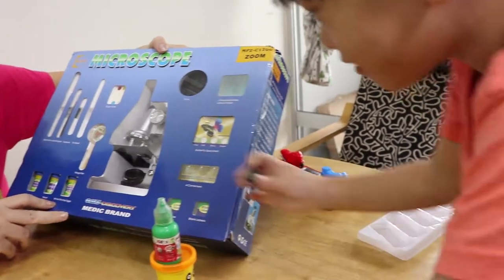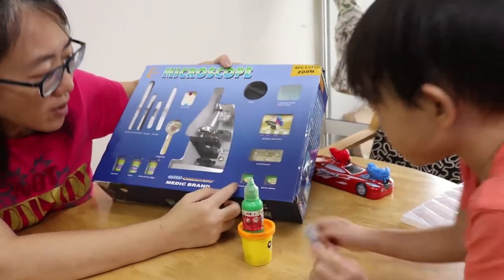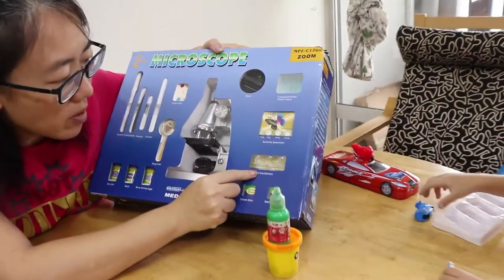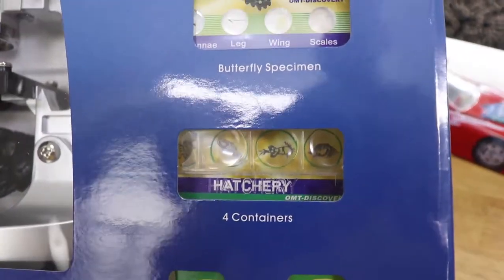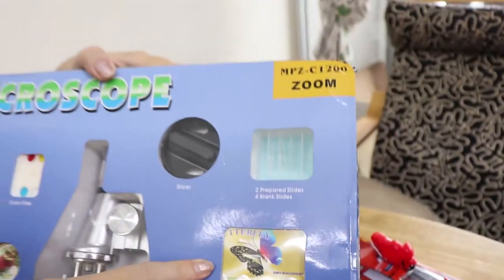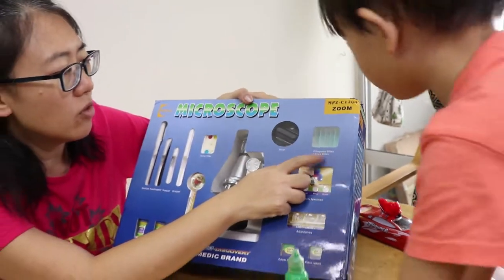Shrimp eggs! There are some blank labels, cover slips, containers to keep your insects maybe, or whatever you're going to get when you go out on nature walks. And some samples of a butterfly, probably. Two prepared slides and four blank slides for you to use.